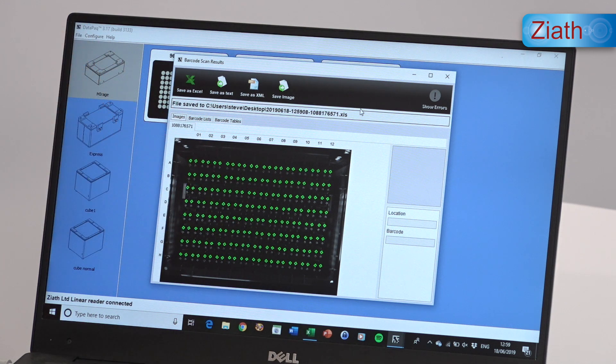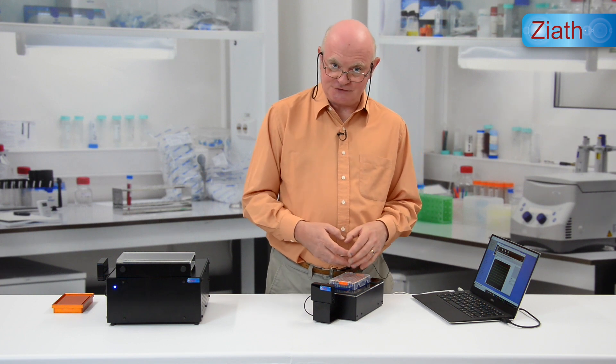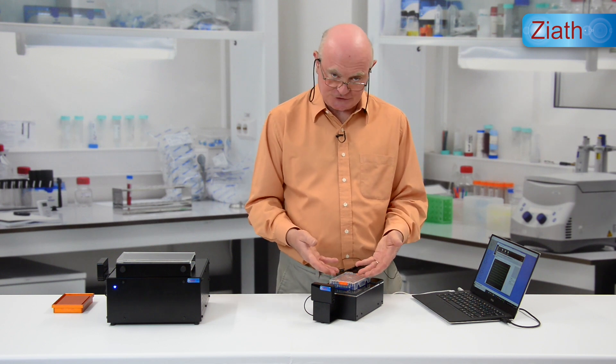As you can see, all 96 wells have been decoded, but only two of the four barcode elements in each position need to be read for it to establish the full barcode ID of each tube. This is a feature of the Brooks Acoustics tube design.